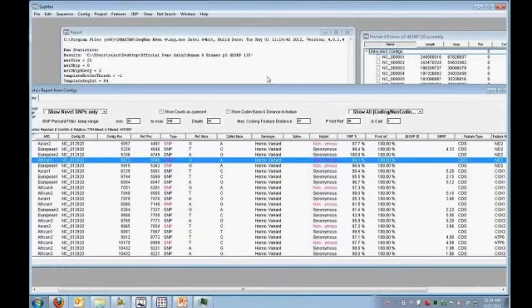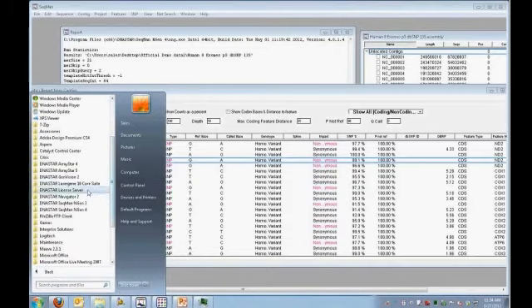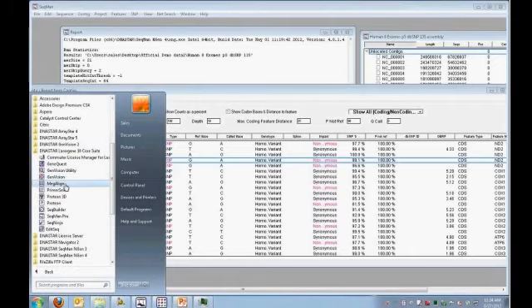So when the assembly is done, you'll have an option to open directly in SeqMan. And SeqMan, if I can actually show you my start menu here, is part of the Lasergene 10 core suite. The Lasergene 10 core suite has a number of different programs in it. SeqMan Pro is one of them, but we have other programs that do things like building clones, designing primers, adding sequence annotations, protein analysis, again, more sophisticated primer design, ClustalW alignments, map making, gene hunting. So it's part of the Lasergene core.